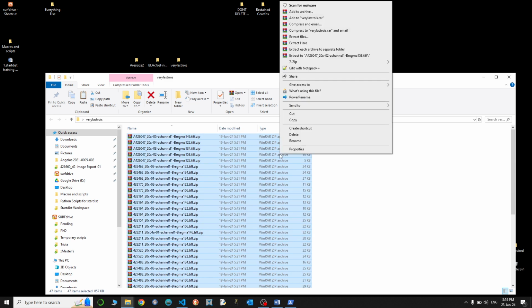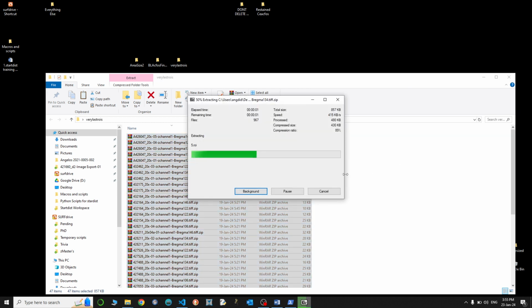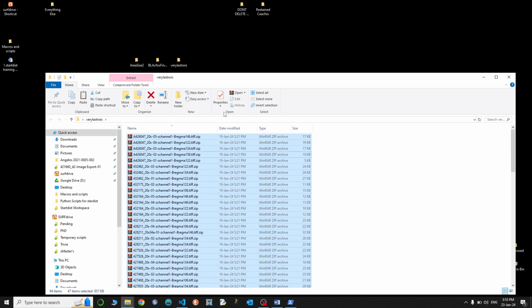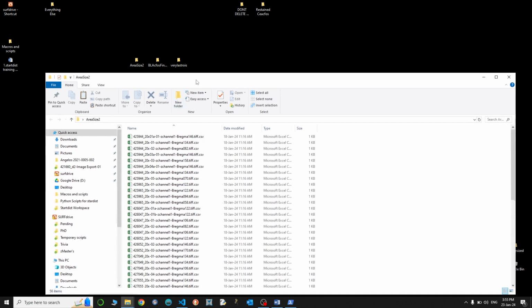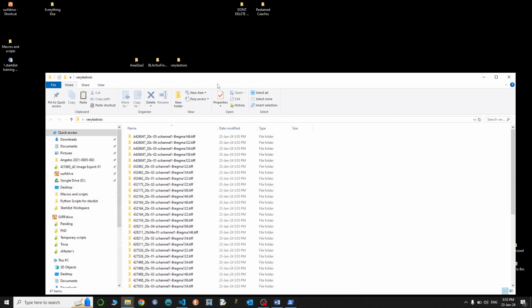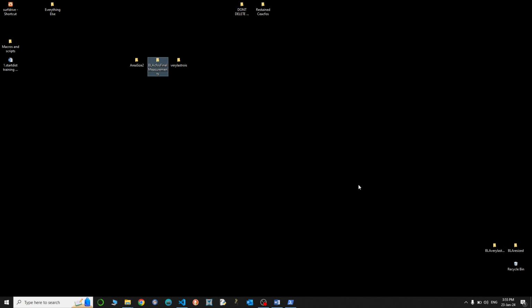And now what I'm gonna do is to get just the folders because I shouldn't have the zip files in here. All right, this seems ready to be used. So as you can see, I have matching names, and the only thing that differs is the extension, of course, for the CSV files. And yeah, everything looks good.